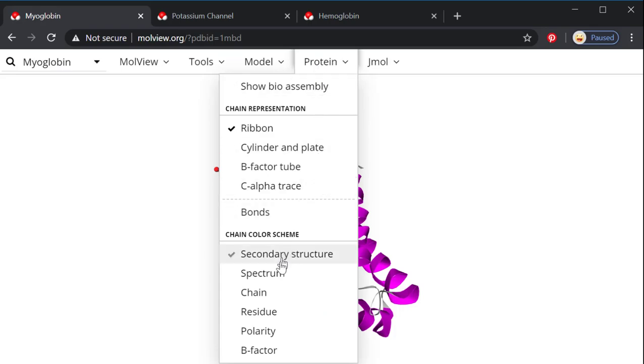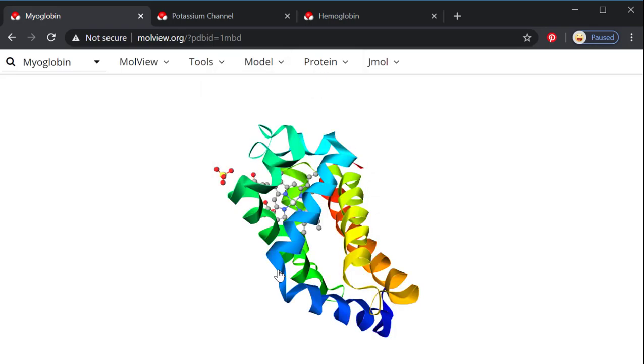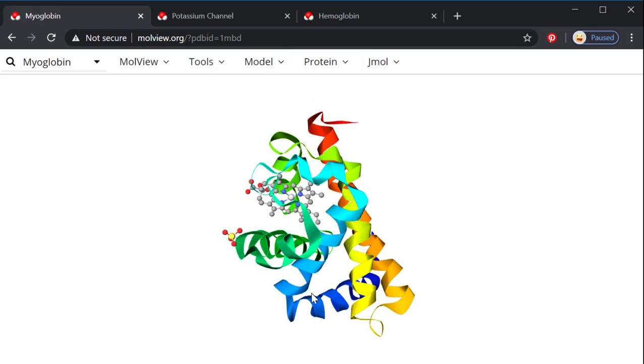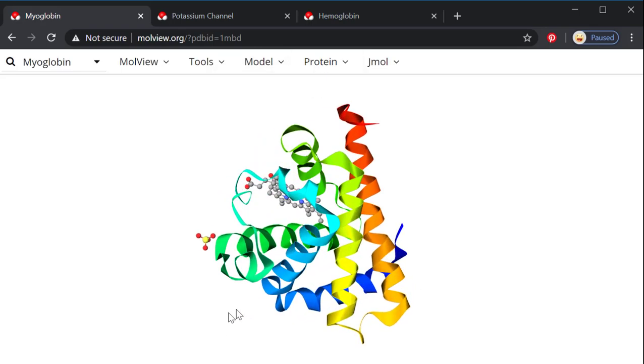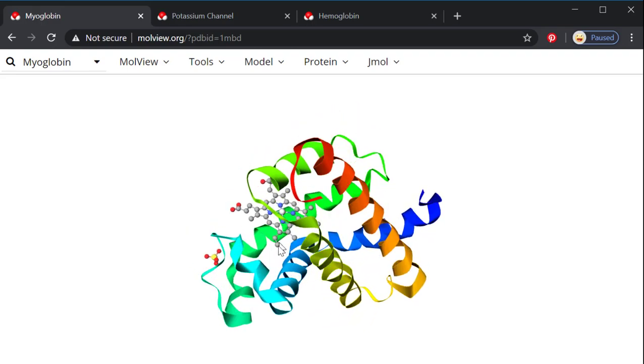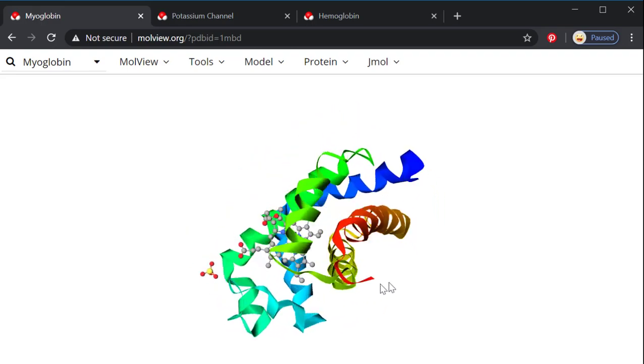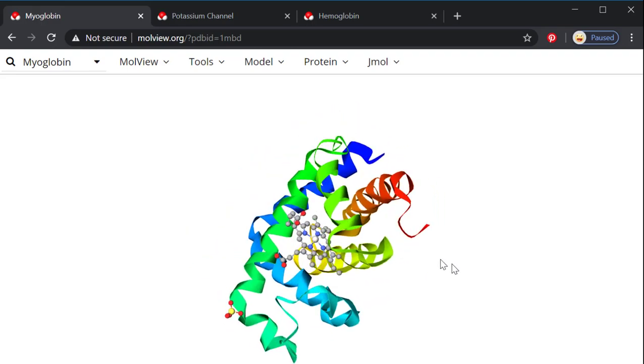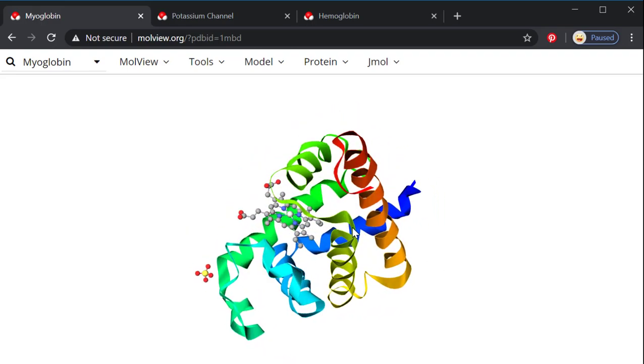So in secondary structure, you get the purples and the blues for those two portions of the protein. Another thing you can do is you can do spectrum, which is just going to put every coil into a different color, which could help you count them or see them here.